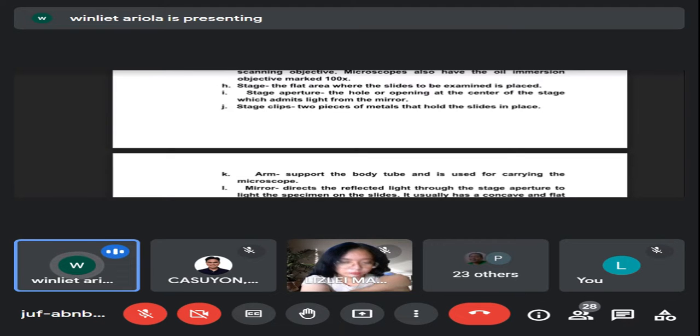So yung ibang microscope kasi, especially yung sad to say, no, especially yung nasa CSM, nasa WIMSU, no, hindi ganoon yung lahat ng microscope. Usually yung microscope doon kailangan natin ng light from the sun or light from artificial things like from your phone, flashlight, no, ganon. So para ma-view niyo yung microscope.